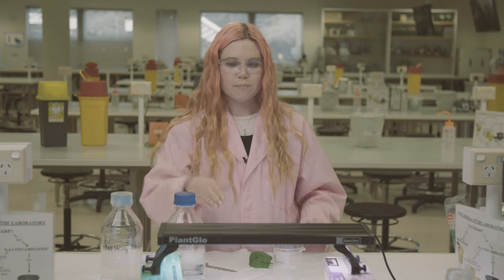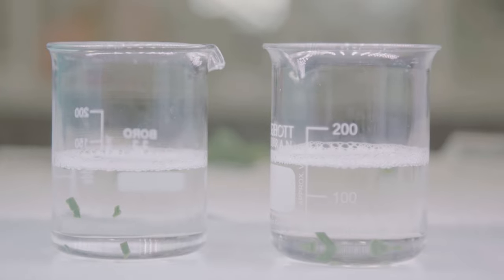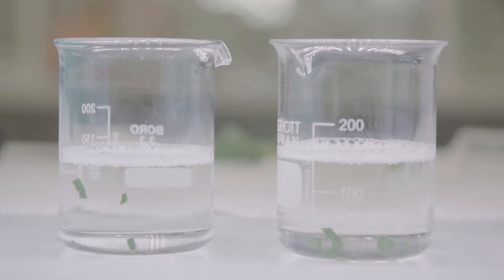Once we get these solutions into our leaves, we put them under this light source, which causes them to photosynthesise. So they'll make oxygen, which will build up on the surface of the leaf and cause them to float.